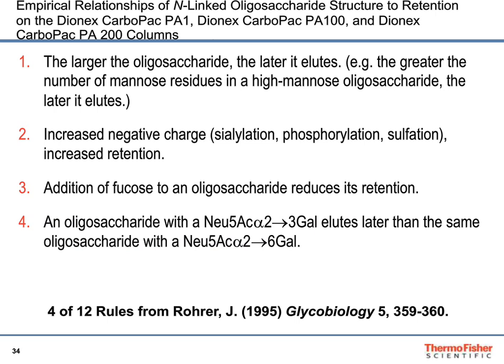Next thing is, since we're doing ion exchange, it's not all that surprising that with increased charge, so increased sialylation, increased phosphorylation, sulfation, we're going to get more retention, so those things are going to elute later.